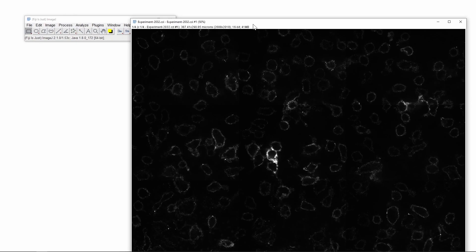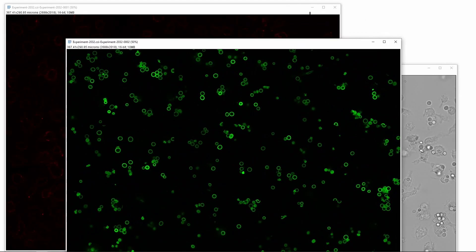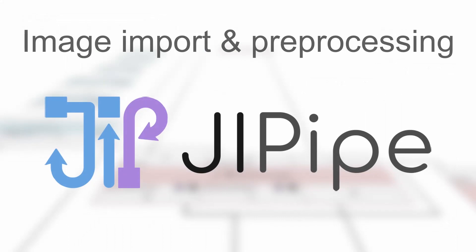ImageJ provides a simple way to separate these channels. For this demonstration, we are only interested in the transmitted light and the green channels. This concludes the first step of the analysis in ImageJ, so let's now switch over to Jipipe and let's see how it's done there.